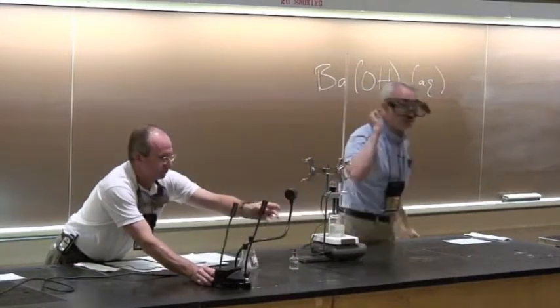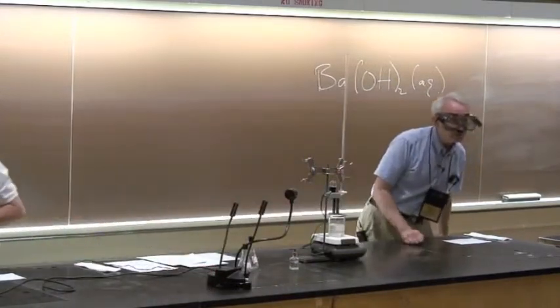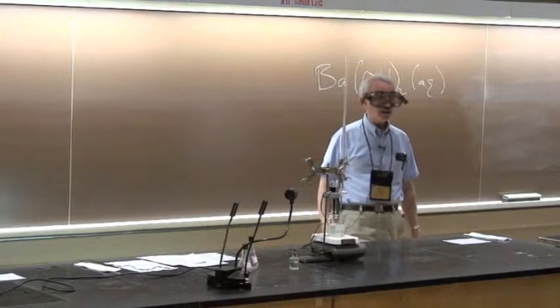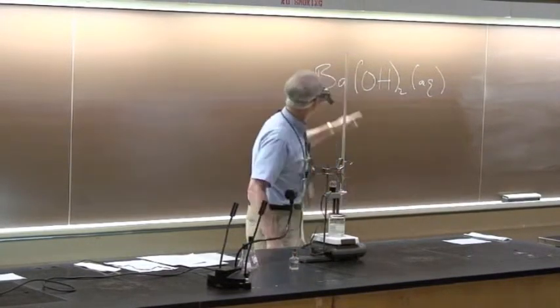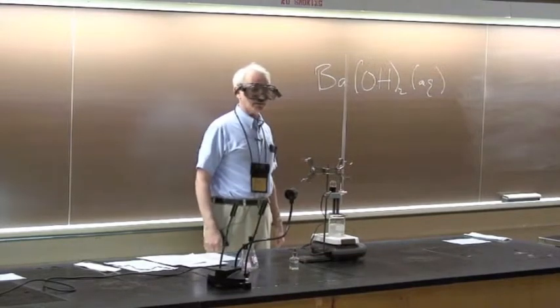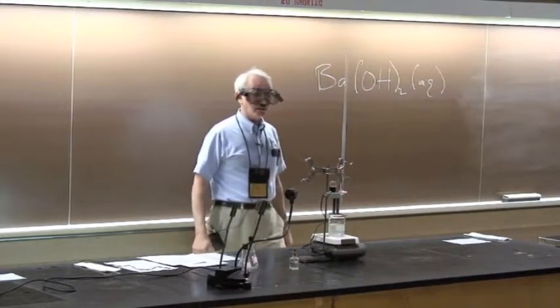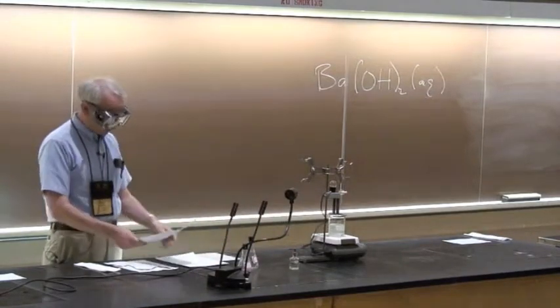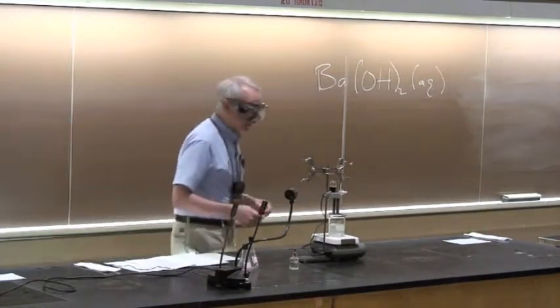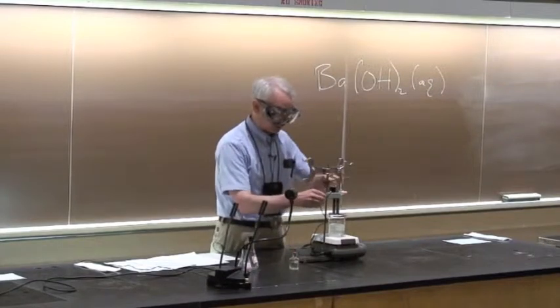Okay. Katie, I don't think you voted. What do you think? No, you have to take a position on this. I'm sorry. Aqueous barium hydroxide. It won't? Okay. We have a vote. We have taken a stand. So let's put it in there.